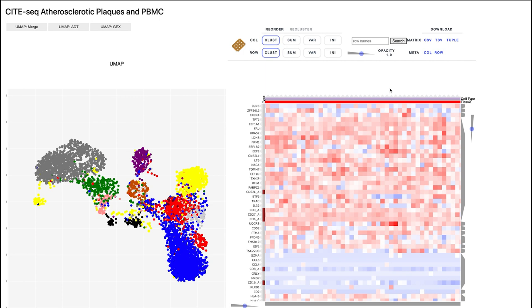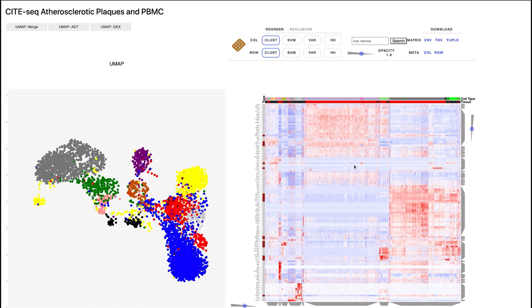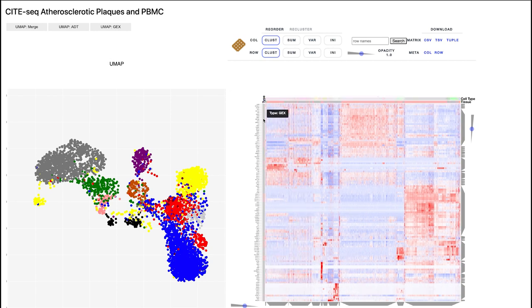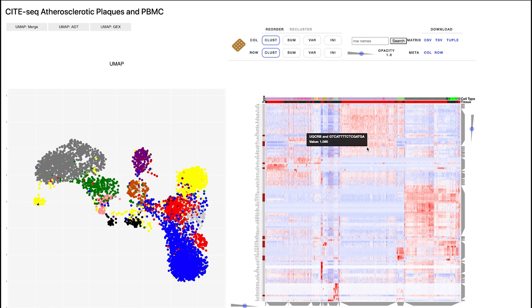For this dataset, we have our single cells as columns. If you zoom in, you can see the actual oligo barcode — if you're familiar with 10x Genomics datasets, you'll recognize that type of barcode. Each barcode is a unique identifier of a cell. For each cell, we're visualizing the top 100 variable genes. The genes are shown in gray and we're measuring 21 proteins simultaneously, so you can think of these as independent datasets that we're mixing together.